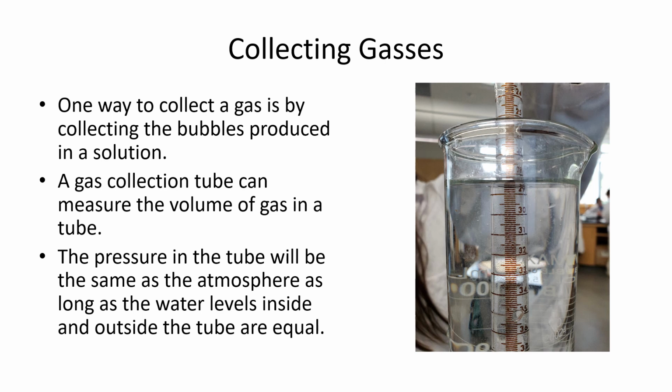Now, equalizing the pressure inside of a tube is also important for many studies of gases. And a neat way you can do that, even in a high school lab, is using a gas collection tube like this one. If you have a cylinder with the tube in it and push it down under the water, you'll find that the water squishes that gas into a smaller volume. And likewise, if you take it up above the water, it'll expand and go to a greater volume.